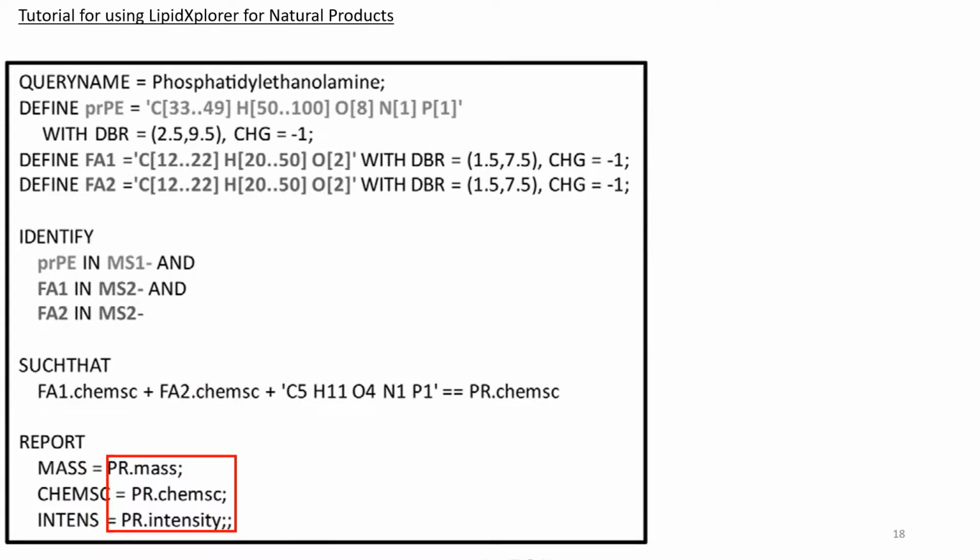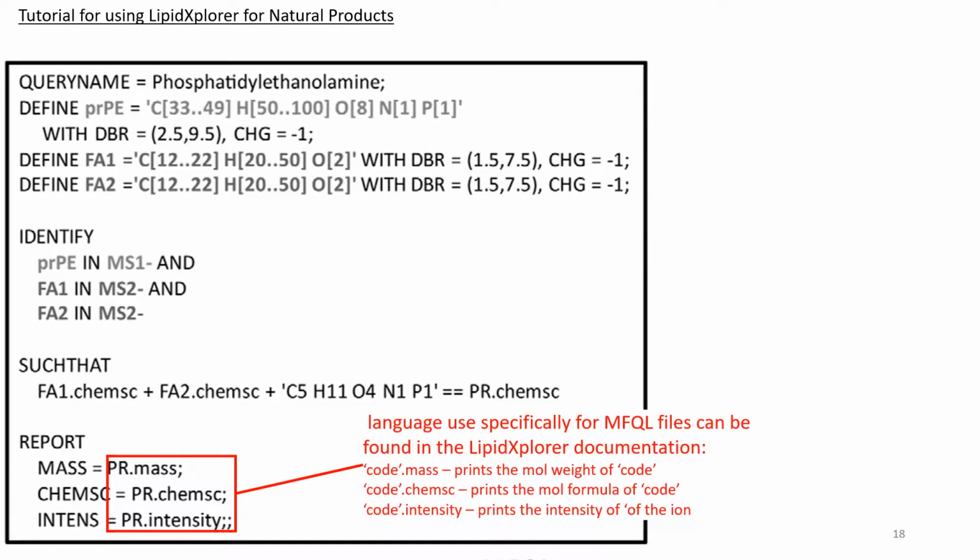So here we can see some codes written in the report part. This is part of the language that was developed specifically for the MFQL files, and it can be found in the LipidXplorer documentation under this QR code.